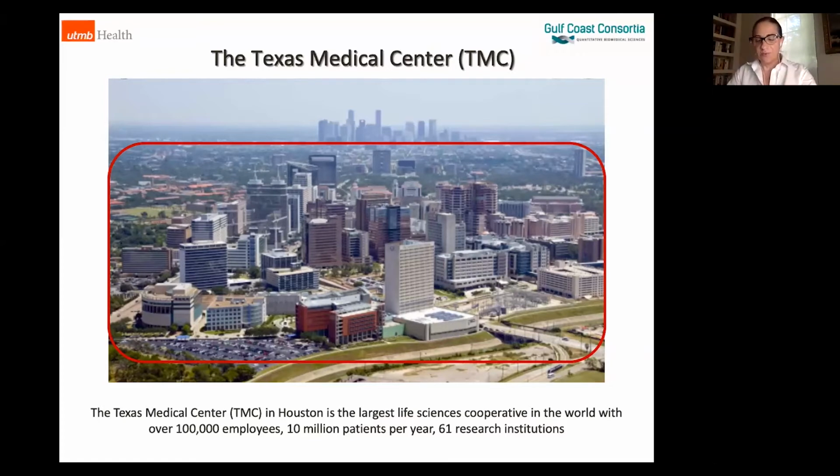And to me, it was really shocking that in the entire TMC, we did not have an automated planar electrophysiology equipment until now. And so I think that the idea of putting together a proposal for the grant competition was really motivated by the local need, and obviously the individual need of specific investigators. So we're very pleased for this.